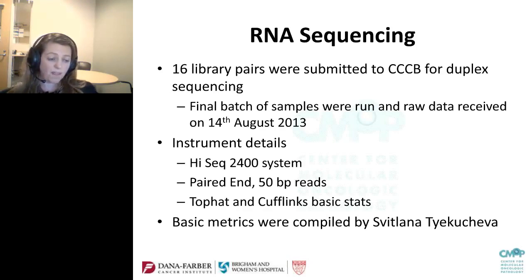We don't think the current algorithms, designed for highly purified, non-degraded RNA, are ideal for FFPE samples. She has a big role in designing new algorithms around FFPE.